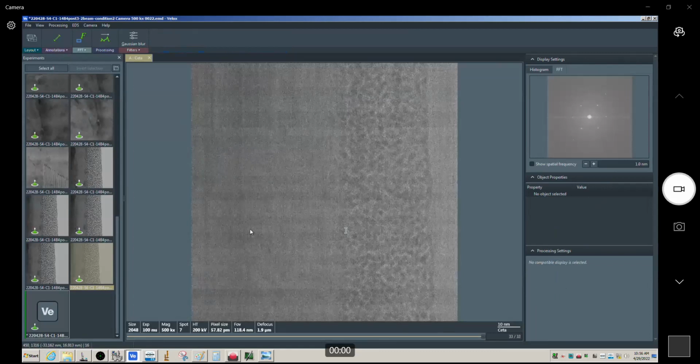It's okay to do this if you have a critical image you want, but I wouldn't make a regular habit of it, because we're going to end up chewing through the hard drive pretty quickly. This is something we have an issue with a lot on the TEMs, because we do this pretty regularly with STEM imaging. All right, we're a little bit more than halfway.